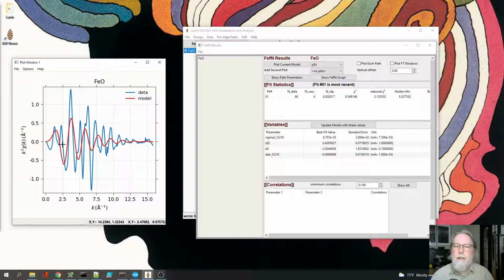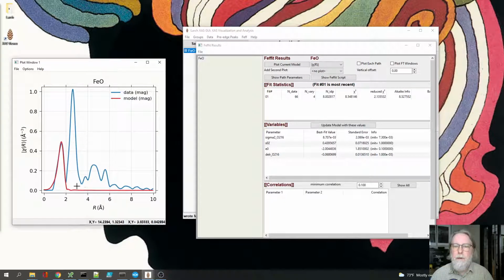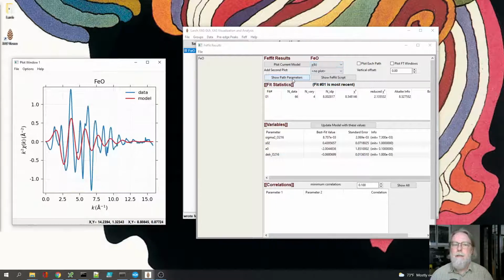It looks like there's no real chance of anyone saying that that's obviously the best fit to the data, or that's even a good fit to the data. But because we're doing a Fourier analysis of it, that is in fact the best fit to this portion of that spectrum that's between 1 and 2 angstroms. It's just that in this spectrum, there's a lot of other stuff going on above 2 angstroms, especially between 2 and 3, say, where there's this huge iron-iron scattering. So again, that is the best fit. It's not that that's an initial fit or a poor fit. That is the best fit.